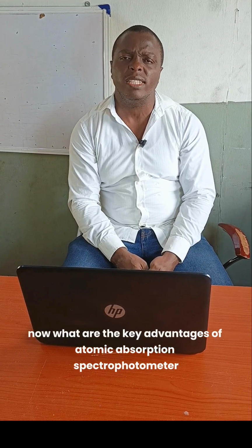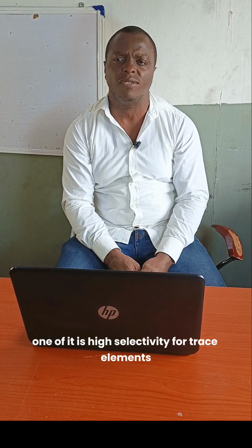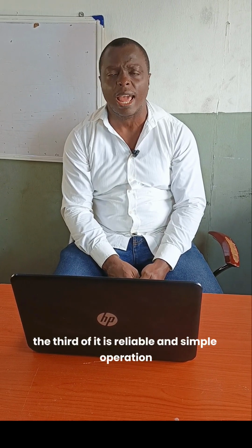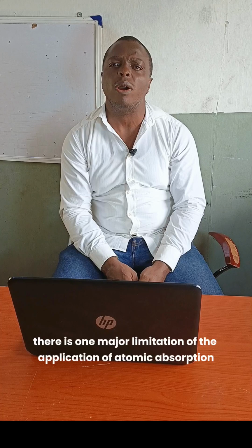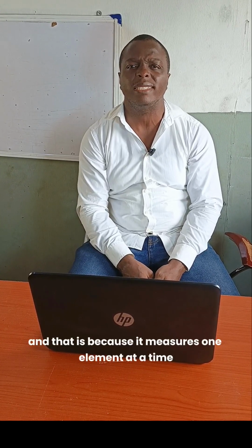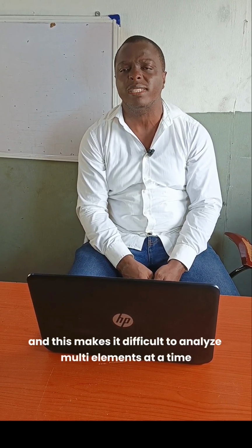Now, what are the key advantages of atomic absorption spectrophotometry? One is high selectivity for trace elements. The second is good accuracy. The third is reliable and simple operation. And the last is that it has wide applicability in different samples. Now, there is one major limitation of atomic absorption spectrophotometry, and that is that it measures one element at a time, and this makes it difficult to analyze multiple elements at a time.